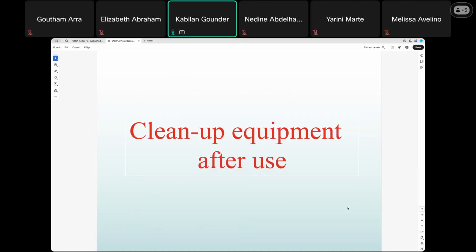So this is the basics of how you can prepare yourself in the lab when you come to work. If you are interested in working in any labs for your lab rotation or research interest, always follow these kinds of guidelines, and also get orientation from biosafety. They have refresher courses and in-person courses to teach you how to be in the lab to protect yourself and others. Okay.